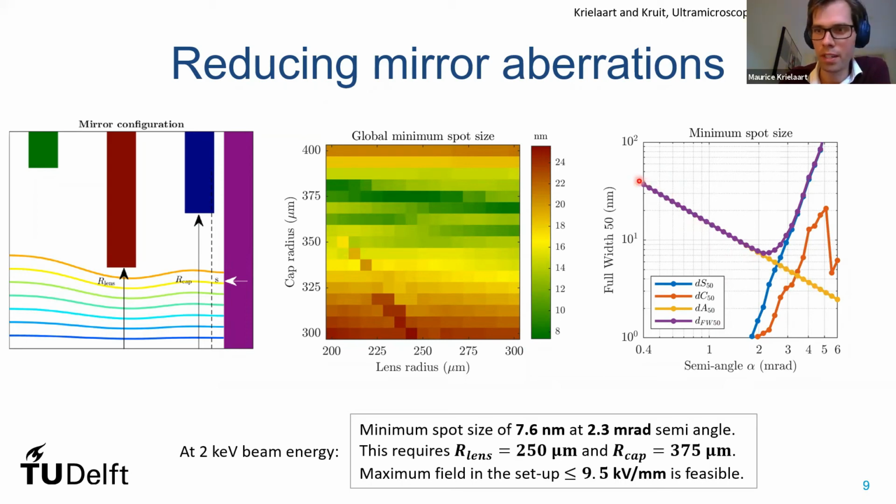So that is your diffraction limit. And then for higher angles, you see it's limited by this blue line, which is, as we already saw before, the fifth order spherical aberration, and here's your minimum. And interestingly, chromatic aberration should not be our first concern here.